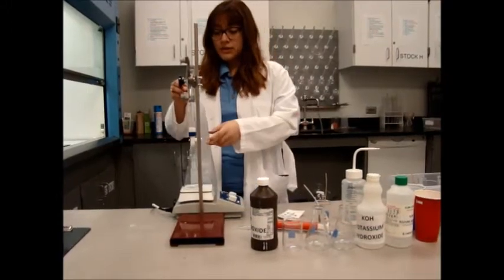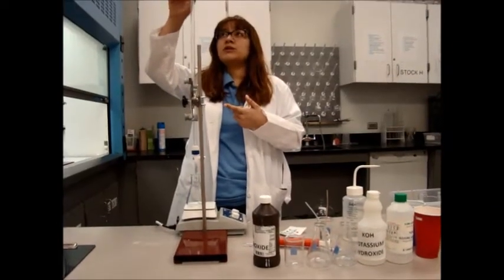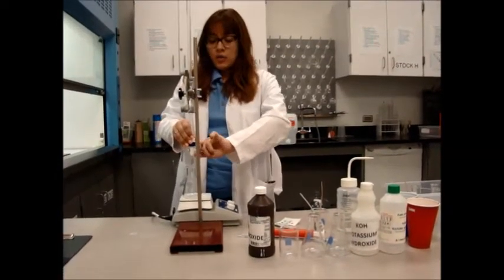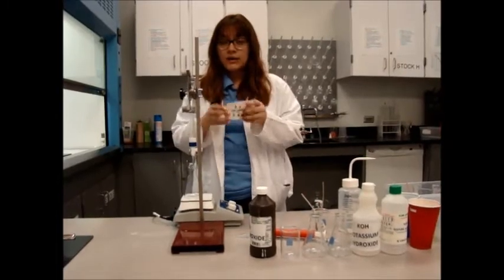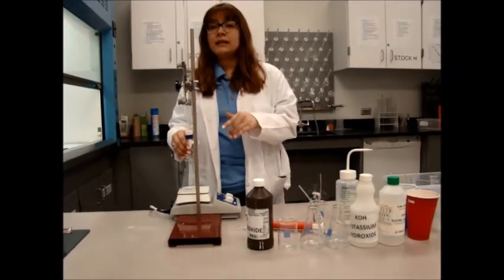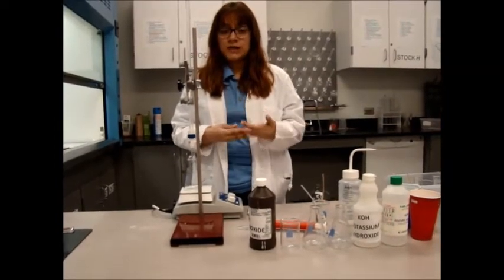Once you have recorded that, deliver 1 ml of sulfuric acid. Watch the burette while doing so to make sure it goes from 0 to 1 — the opening motion is simply just this. Once you deliver 1 ml, go back and record the pH as well as the color. Repeat those last two steps until you have added 10 ml of sulfuric acid into the barium hydroxide. That is the first part of your practical exam.